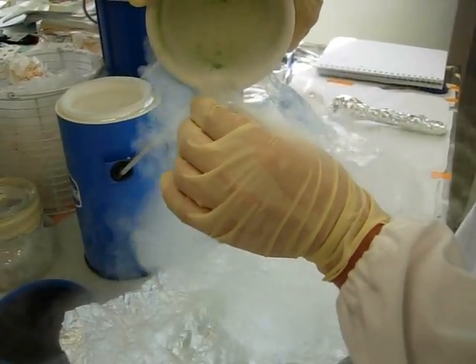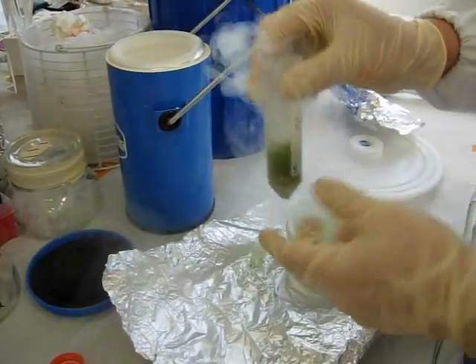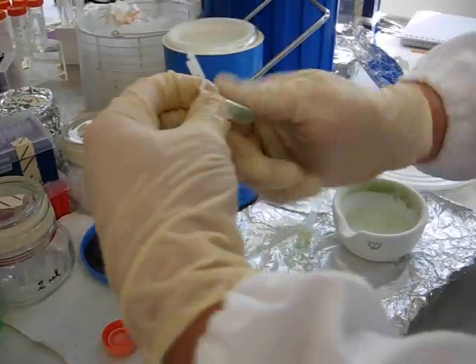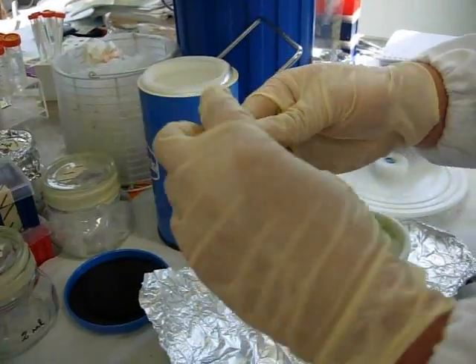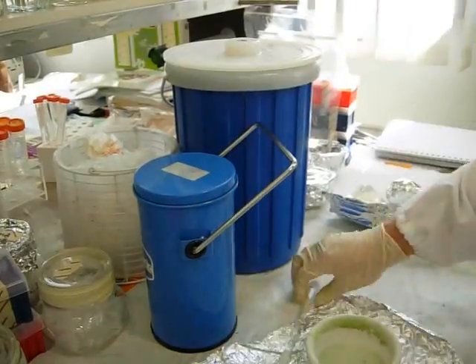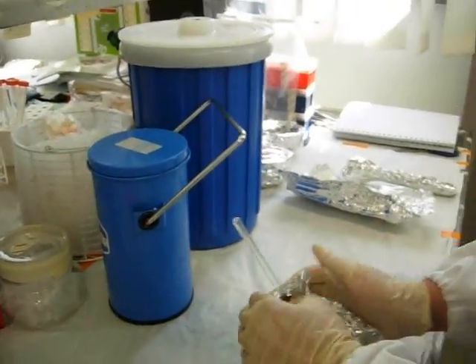I put it inside the falcon tube and freeze it back to minus 80. So when I need it, I take it out and add more powder. For these samples, when I see that the nitrogen is gone, I close them and freeze them back. That's basically all you need to know about this part. Thank you.